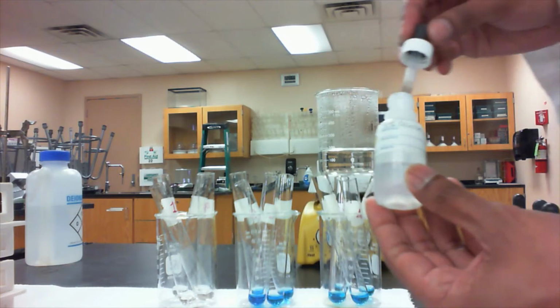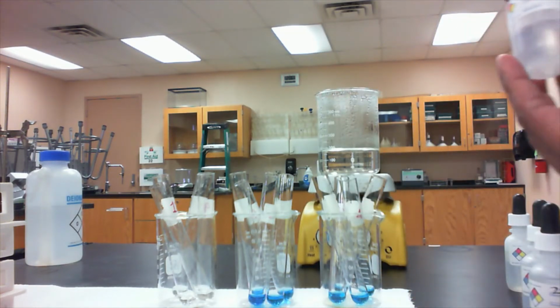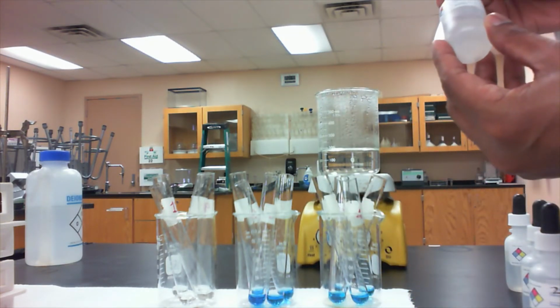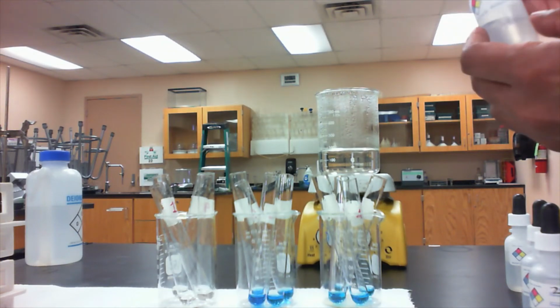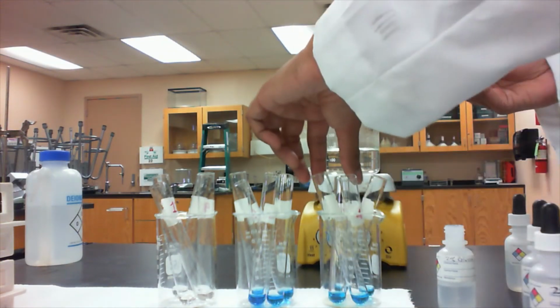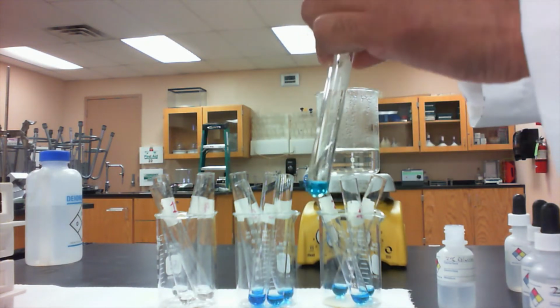I'm going to take my dropper and add 10 drops of the glucose solution to test tubes 1, 5, and 9. So here's test tube 1. I'm going to add 10 drops.